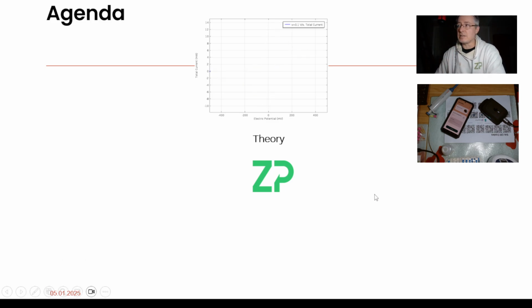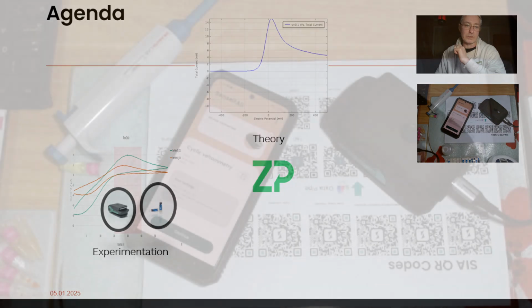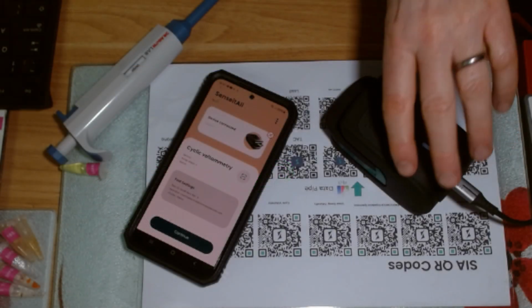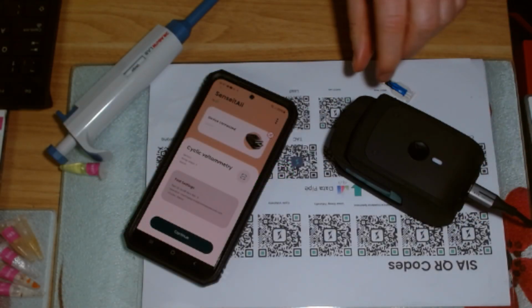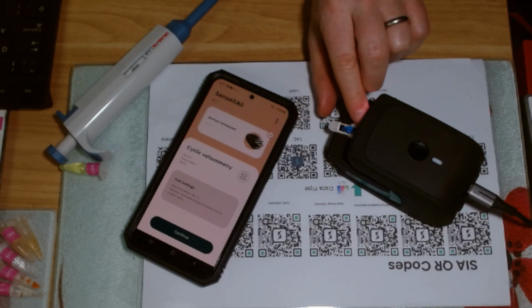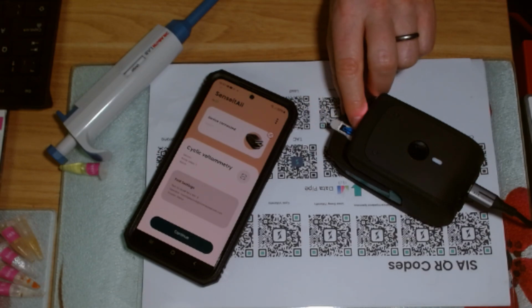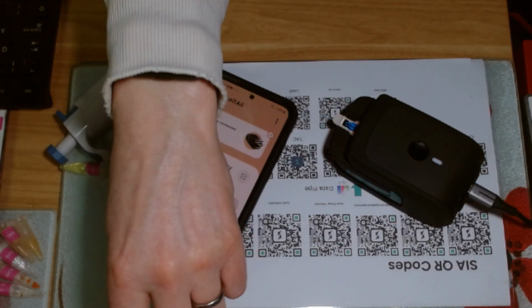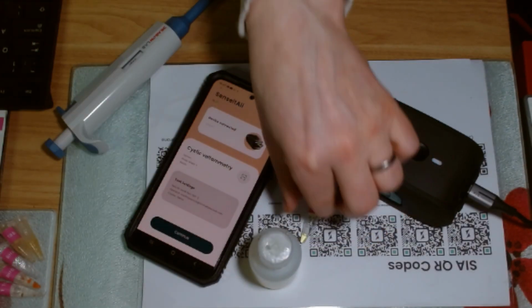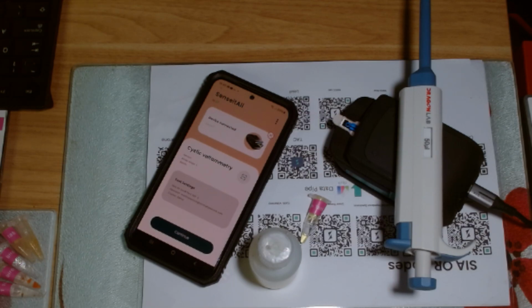I have a potentiostat in front of me, so I really like practical science. There's a theory that describes voltammetry, and at least with electrochemistry, it's actually quite straightforward in this modern age. Potentiostats are not necessarily super big or super complicated anymore. I can set this experiment up in possibly 5 seconds. So I've just put the electrode in there, no cabling required, it does match up. I can close that, and that's attached. I've got some solutions here, and I will add some solution to that electrode in a minute.